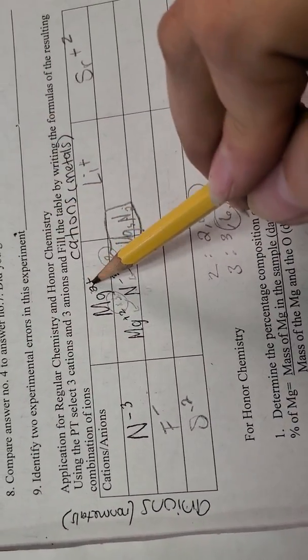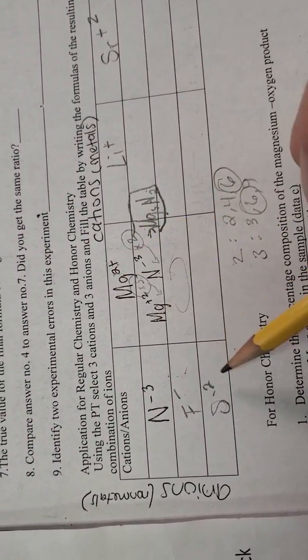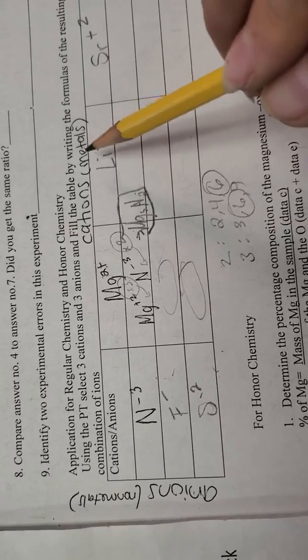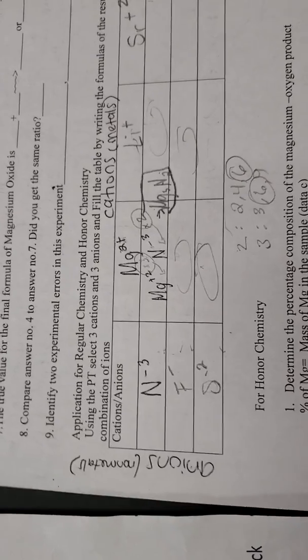Let's do sulfur. So you would then take magnesium, combine it with this guy, and put his compound. Him with him, here, him with him, etc. Okay, so you should have all of this filled out with 9 different compounds based off of these combinations.